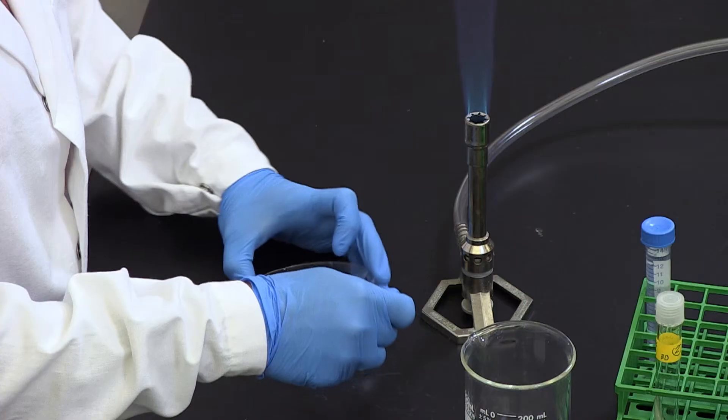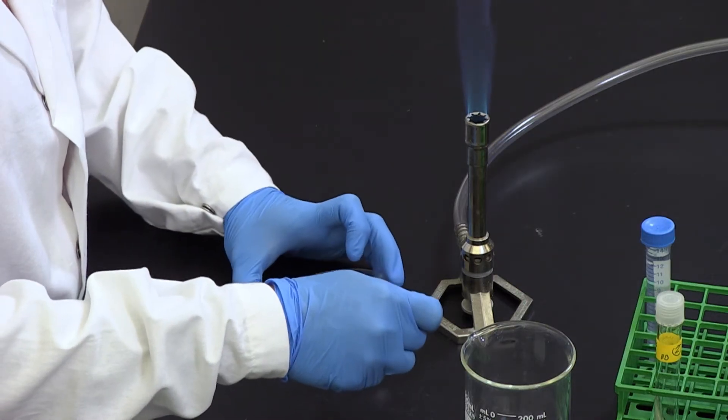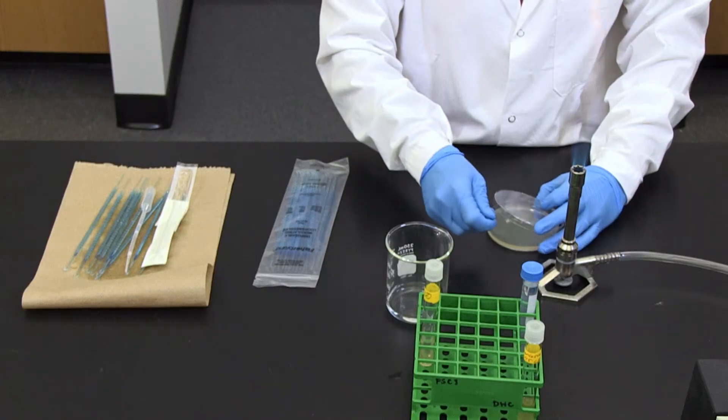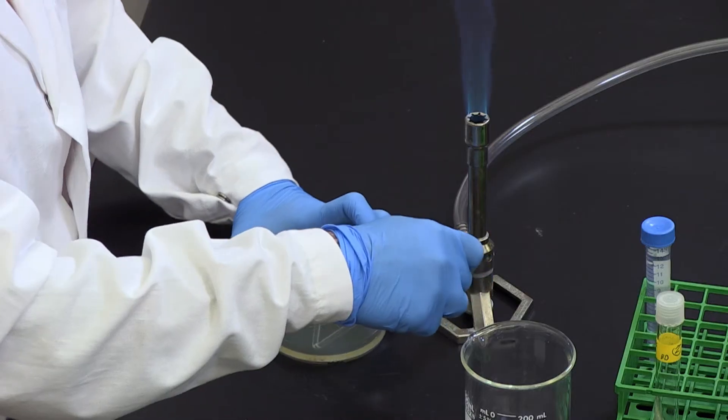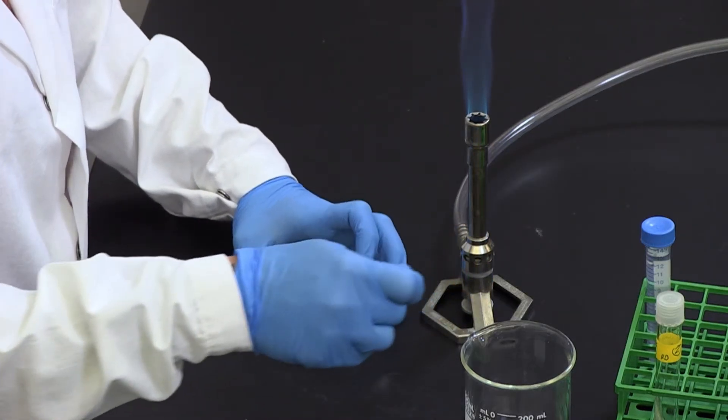Fifth, lightly touch the sterilized cell spreader to the surface of the agar and move it back and forth while turning the plate manually. This ensures the cells are spread evenly over the entire agar surface.